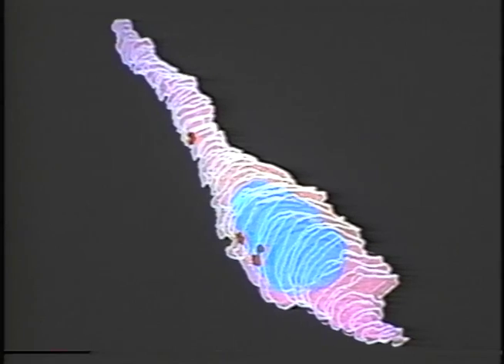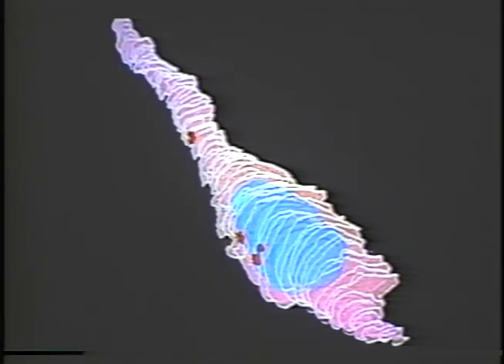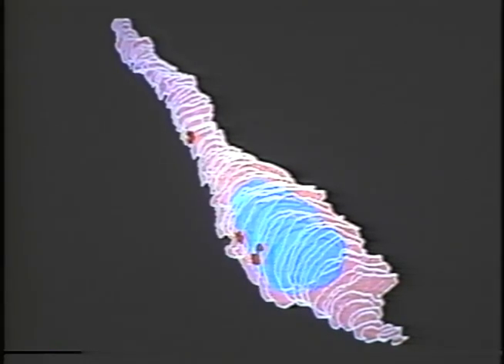However, it's semi-transparent so that one can look inside and see the nucleus. And the nucleus consists of dark blue contours with a light blue fill. And the nucleus is hidden line with respect to itself. So it gives an appearance of solidity, but semi-transparency at the same time.